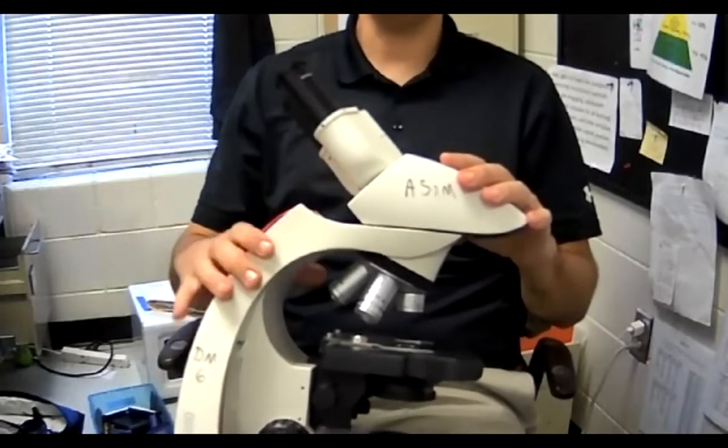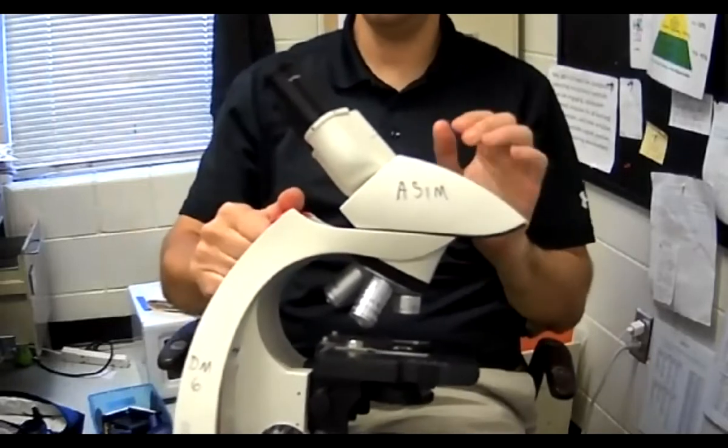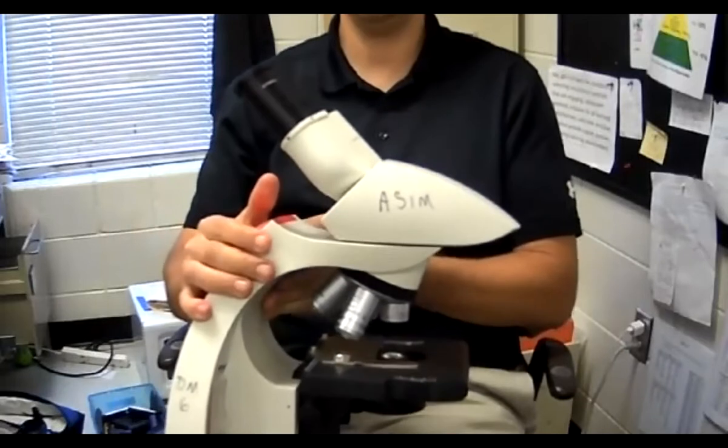This part right here is the arm — this part where you hold is the arm, this one right here.